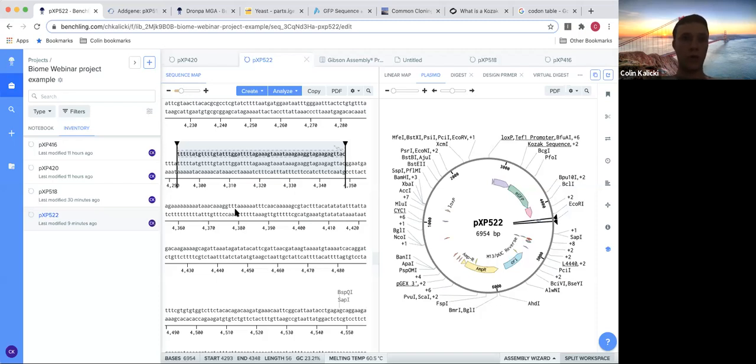That's one good way to test, like, if you include some other things in your promoter regions, you can see how effective it is at transforming it. And you want to test your plasmids before doing it. That's also why Gibson Assembly is really good, because it's not as easy to do that. The way you code very specifically prevents that little short overhang, which would make them easier to come back together. So yeah, good question. Great question, Arthur.